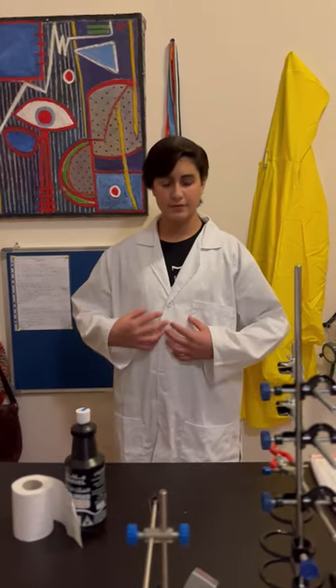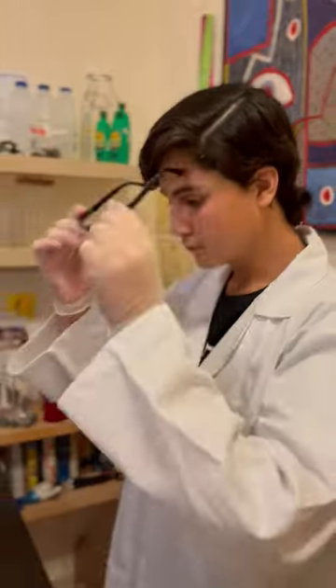For this experiment, a decent lab coat, some vinyl gloves, and safety goggles should suffice.